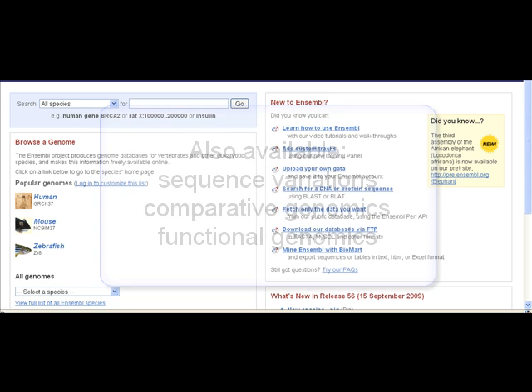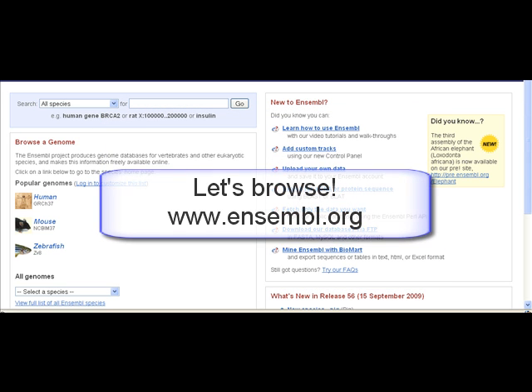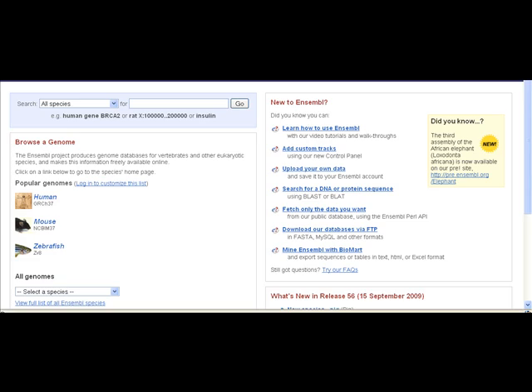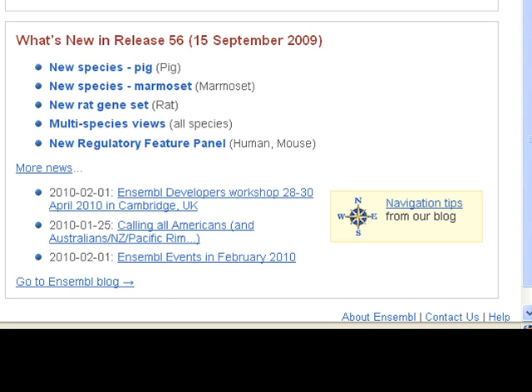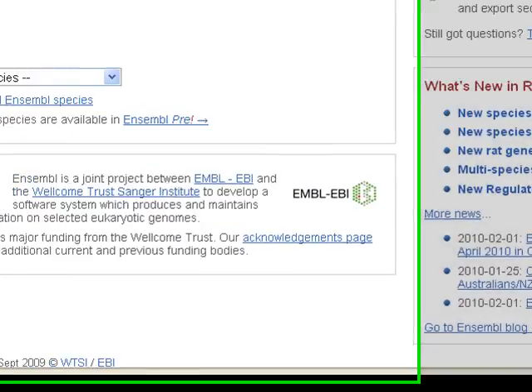Let's see how the browser arranges this information. Start at the Ensembl main page. Every two months, the browser and underlying databases are updated. The news announces new species, gene sets, and any updates or changes in annotations such as variation mapping.